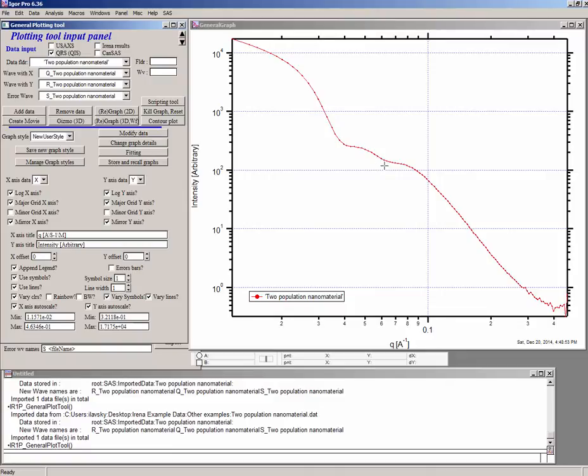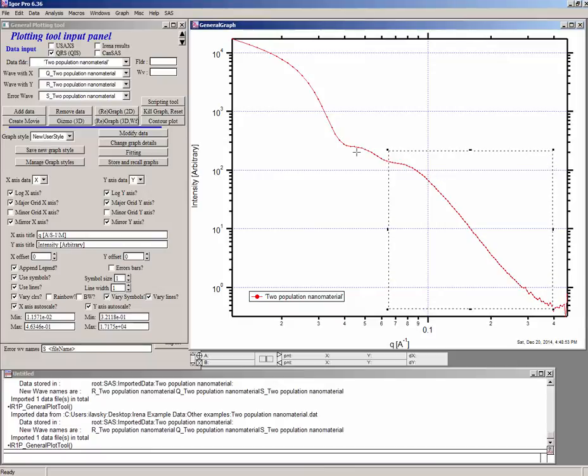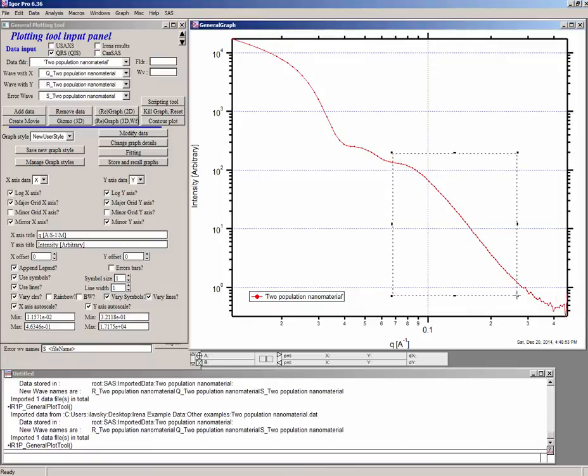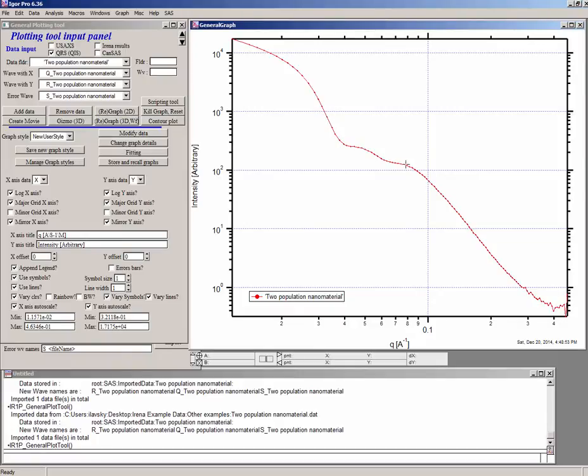Then of course this data would continue oscillating and falling down. This part here is a second population. It sticks out too much. It must be a second population. So that's the second population. That's a finer, smaller size nanoparticles. So we need to fit this with two populations. One of them is going to be nearly monodispersed or relatively monodispersed. The other one is going to be broader because we do not see oscillations coming out of it. So the smaller particles are actually more polydispersed, relatively more polydispersed.